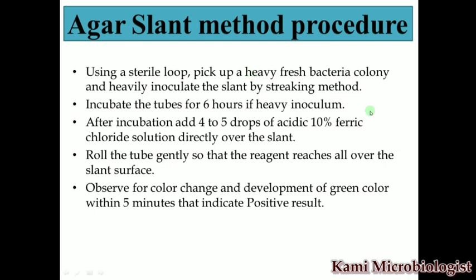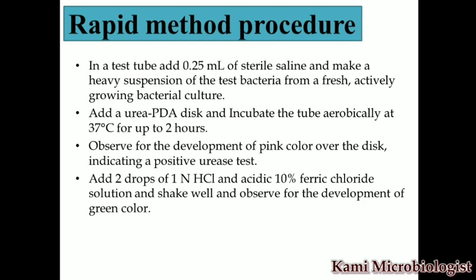Within the 5 minutes you will check the color, the development of the green color or dark color. It will indicate what? It will indicate the positive reaction or positive result.